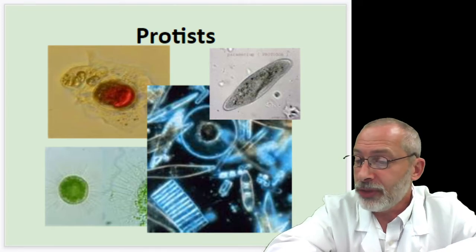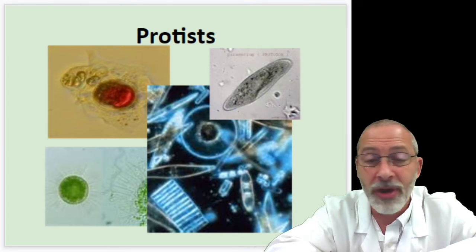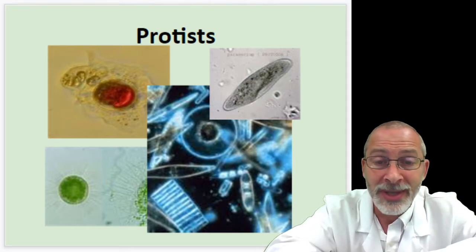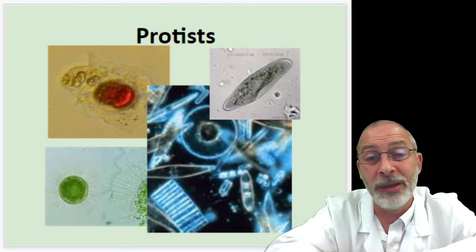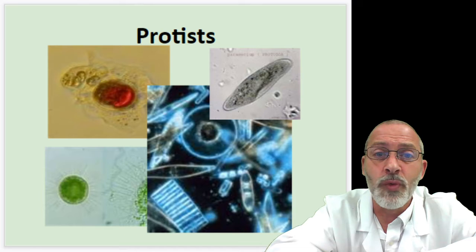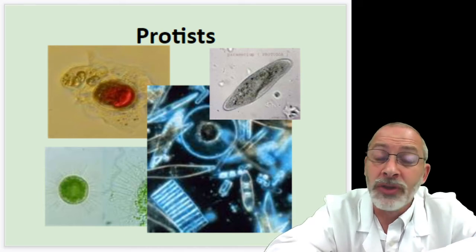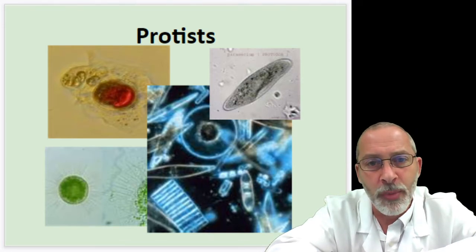So as the problem states, what are some ways protists differ from one another? We've already talked in our notes about similarities and differences, but not all of these are things that can necessarily be seen. So in our lab today, you're going to be examining 4 different specific kinds of protist species. And so the question is, what are some ways protists differ from one another?